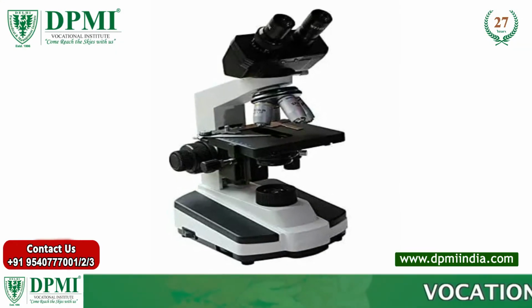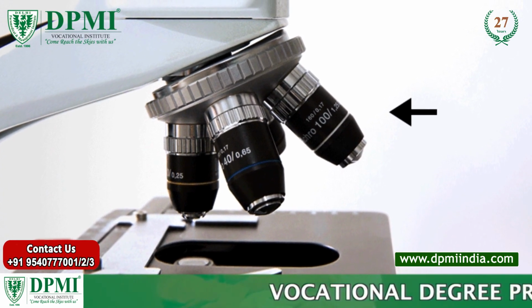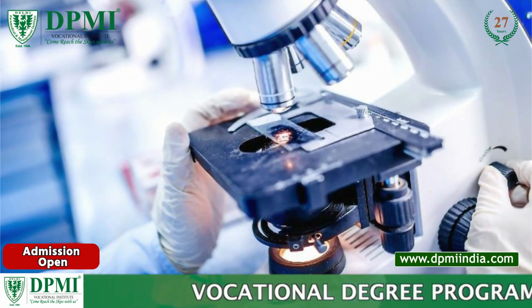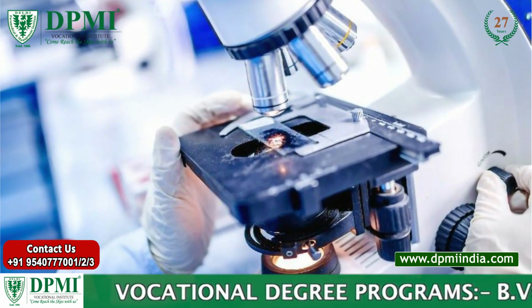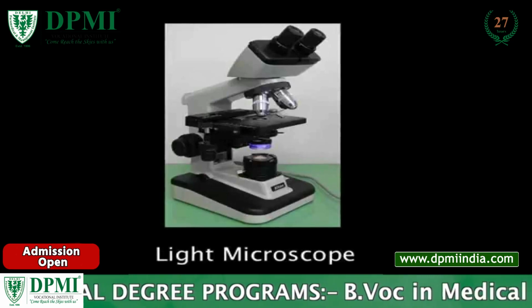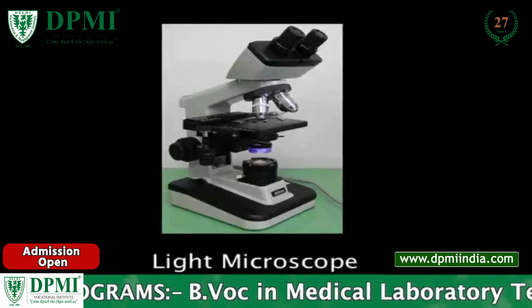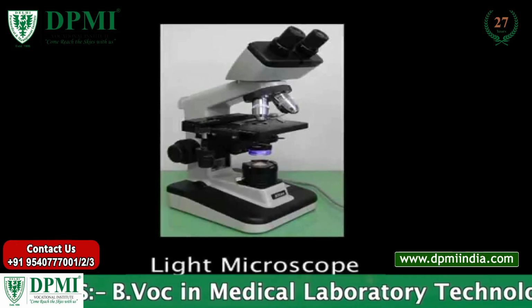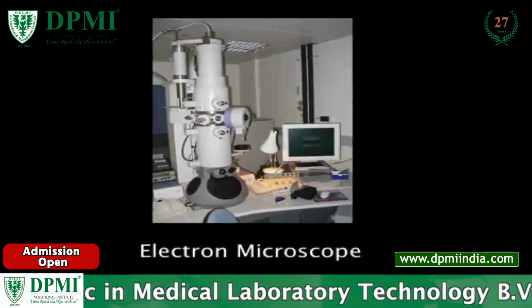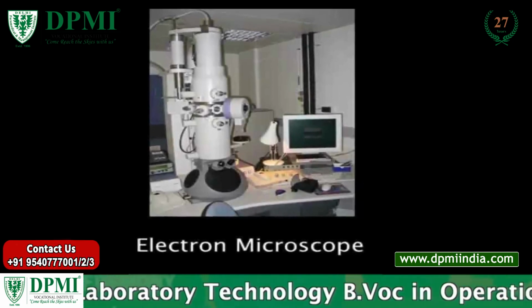Microscope. A microscope is an optical instrument that magnifies small objects to make them visible for detailed examination. There are different types of microscopes, but the two main categories are: the light microscope, which uses visible light to illuminate specimens, and the electron microscope, which uses electron beams instead of light for higher resolution.